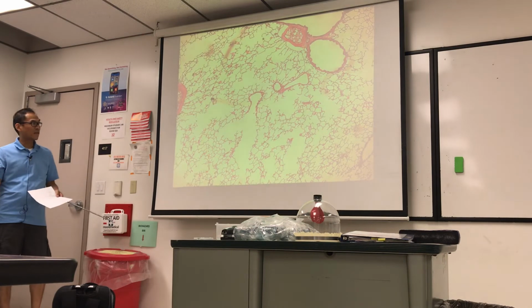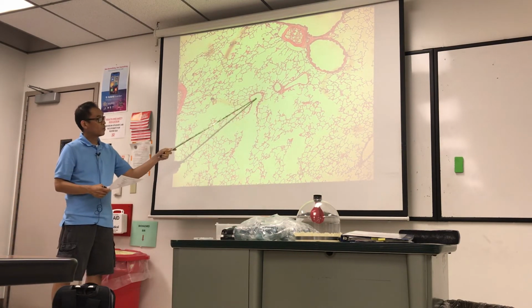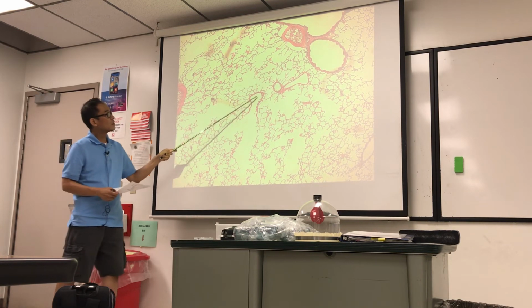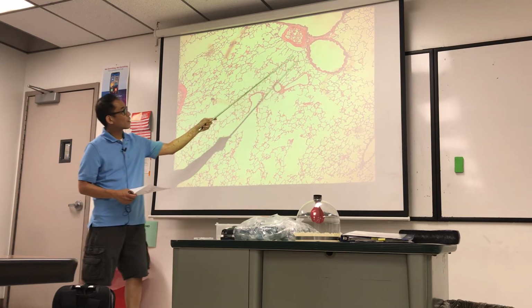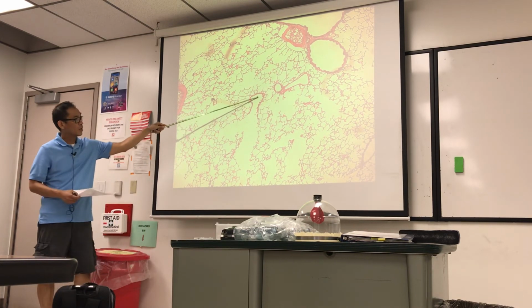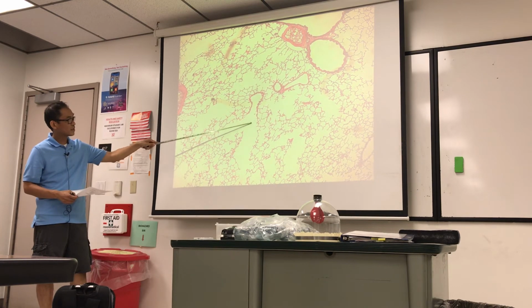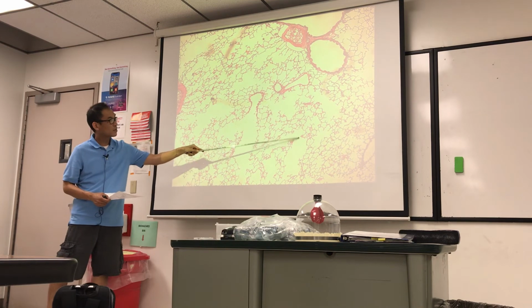Now we get deep inside the lung tissue. Here's the slide for respiratory bronchiole. If you see the epithelium there, I would say any of these are looking like respiratory bronchioles. These look more like blood vessels. That's definitely a blood vessel, but I'll stick to this. This is a good respiratory bronchiole, because as it branches out into alveolar ducts, they're nice long hallways. Alveolar ducts.